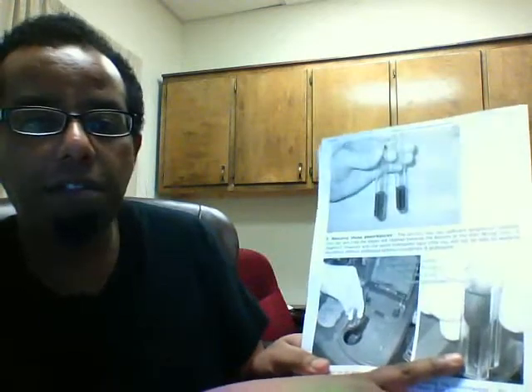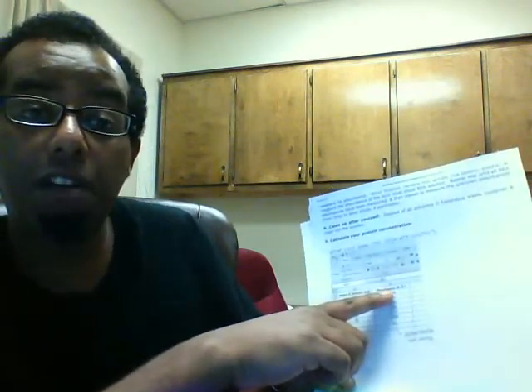So we use the cuvette, and now what you are going to do is go on D2L. Each of you is going to have the mass of the protein, for us in milligrams per milliliter, and the absorbance at 595 nanometers. It turns out that the dye by itself absorbs at 470.